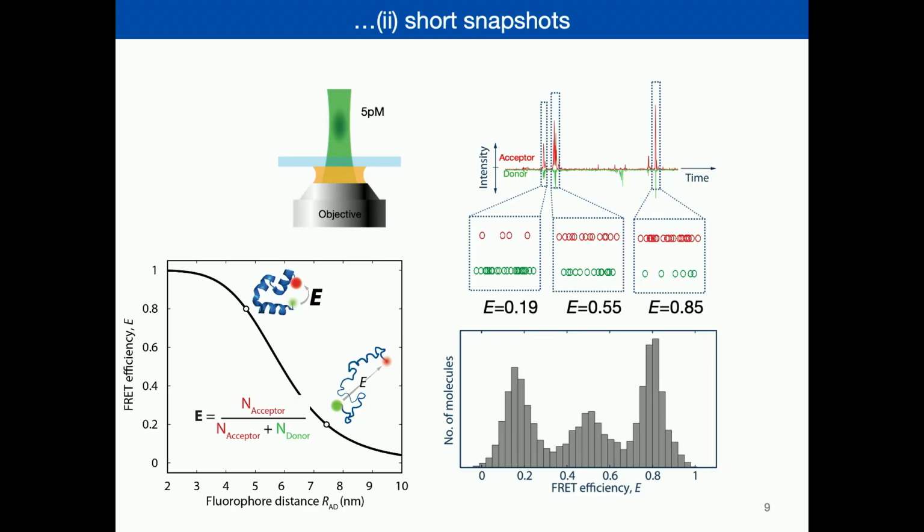From that, what you read out already is that you obviously don't have a homogeneous population of your protein structures, but a heterogeneous one with at least 3 different kinds of states, which you could approximate, for instance, with 3 Gaussians in this case.